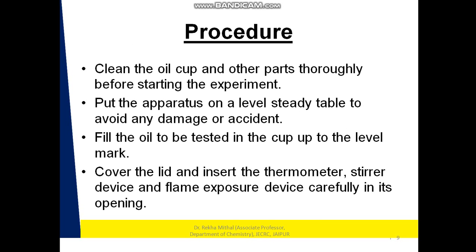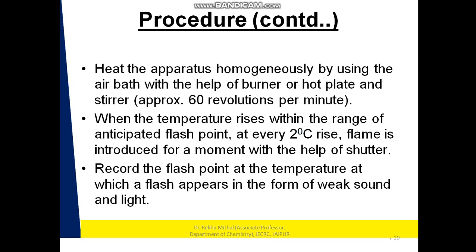Now we come to the procedure. Before starting the experiment, we should know what steps we have to follow. First of all, clean the oil cup and other parts thoroughly before starting the experiment. Put the apparatus on a level, steady table to avoid any damage or accident. Fill the oil to be tested in the cup up to the level mark. Cover the lid and carefully insert the thermometer, the stirrer device, and the flame exposure device in their openings.